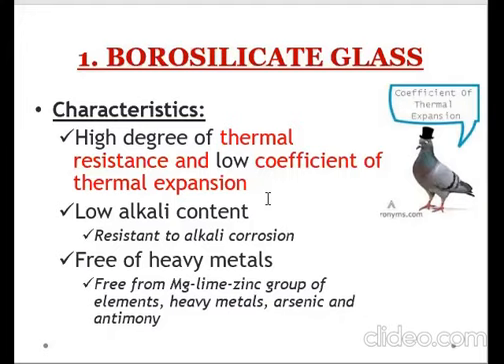So, because of the low coefficient of thermal expansion, it allows manufacturing of those kinds of borosilicate glass. And as a result, those heavy walls give more mechanical strength to the glass. Kasi nga, mas kumapal na yung glass. It gives more mechanical strength to the glass while retaining a reasonable heat resistance. Okay?